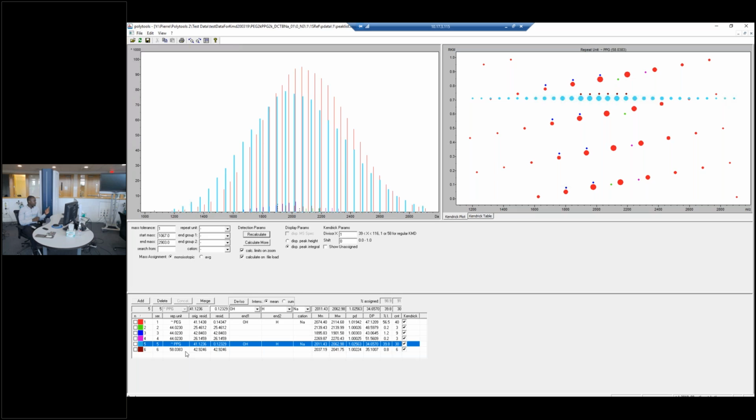But there is a NIST library or link that I can share with the interested person. It's usually maldi.nist.gov, which has quite a plethora of different types of sample preps and conditions for most of the polymers that have been analyzed up to this point. For something like PEG or polystyrene, that should be pretty easy. There's quite a lot of choices, such as you can use DCTB or dithranol for polystyrene and things like that.